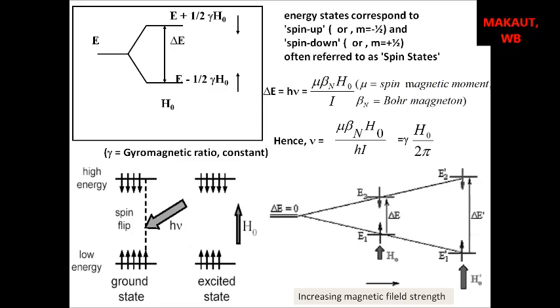But once they acquire this particular difference in energy, which is in the radio frequency pulse, this radio frequency will give the system energy, and then in the ground state the spin will go up. This causes a spin flipping, and this spin flipping is basically giving the resonance.